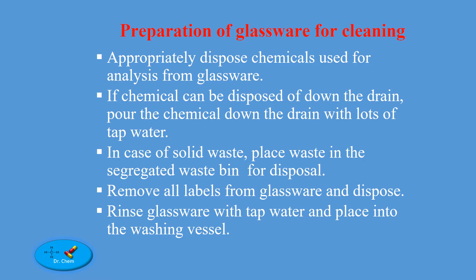Appropriately dispose chemicals used for analysis from glassware. If the chemical can be disposed of down the drain, pour it down the drain with lots of tap water. In case of solid waste, place waste in the segregated waste bin for disposal. Remove all labels from glassware and dispose. Rinse glassware with tap water and place it into the washing vessel.